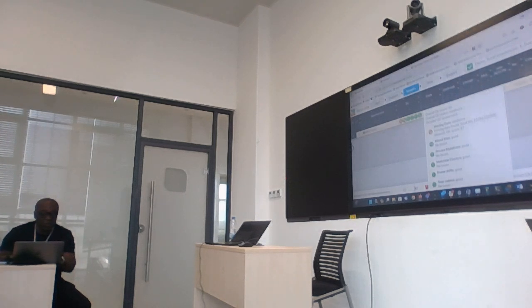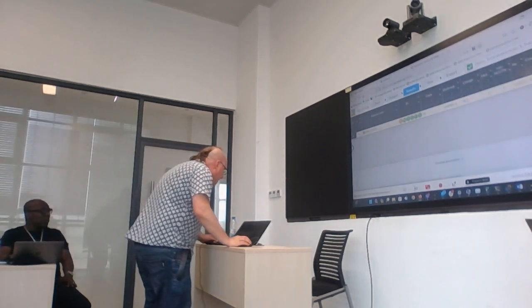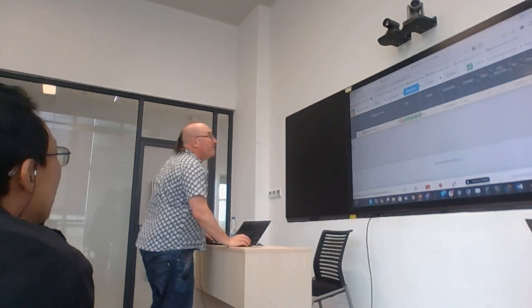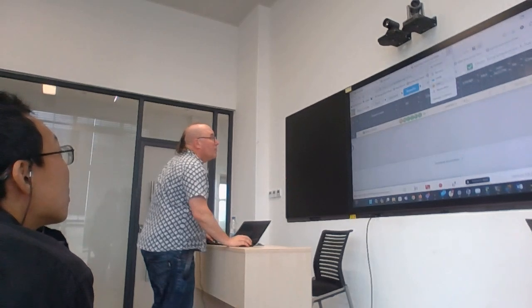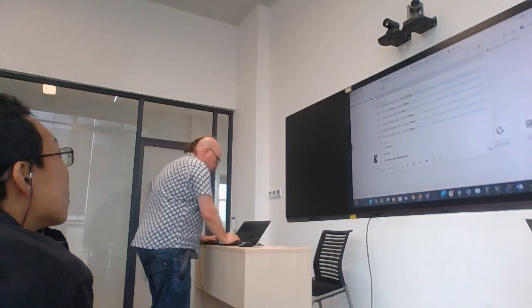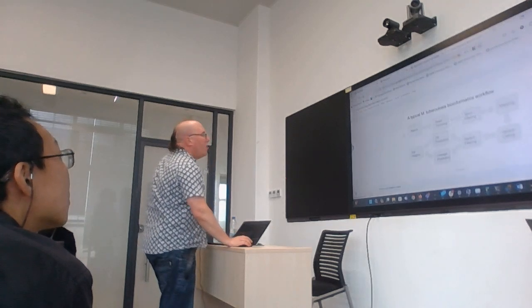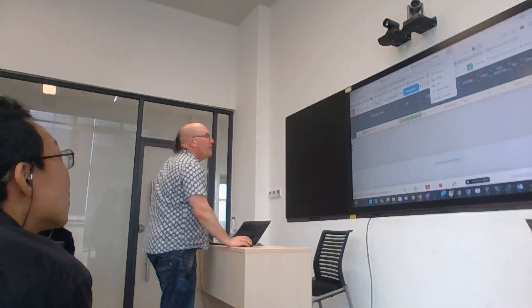Let me just go back to my slide. If I can find that slide. Do I have that slide somewhere? Yeah, but finding things on my computer is... maybe. There you go, I think it's this one. Oh, another untitled presentation.